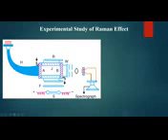That's why the study of scattered light is done perpendicular to the incident light, and it is made to pass through slits. These are small slits, and there is a convex lens in order to focus the scattered light on the spectrograph. This spectrograph may contain a prism of high resolving power, and the spectrum can be taken on the spectrograph. You can take a photograph of the spectral lines observed coming out of the window.